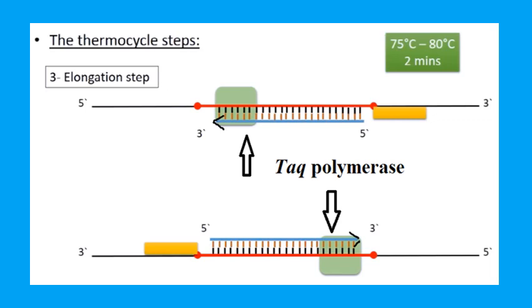This leads to the extension of both strands, finally forming two strands.